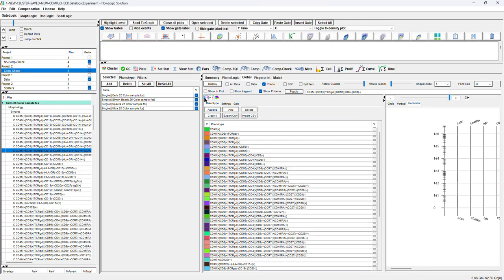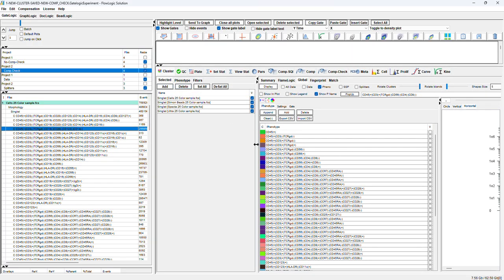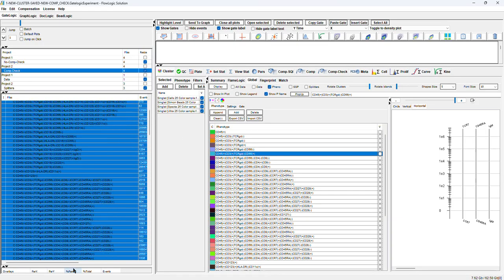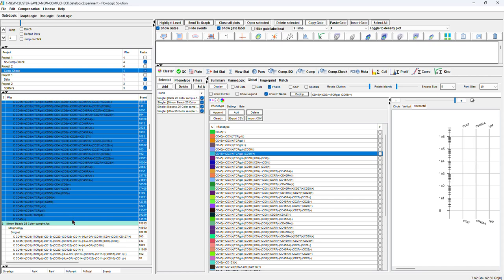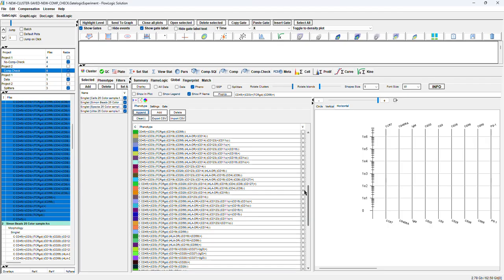And after you got all your population, obviously you are interested to visualize your population. So what we are doing, we take all of these here so we can compare the population, because this is the phenotype. If we extract this, we extract everywhere. But what we are interested in is the population that we extracted.